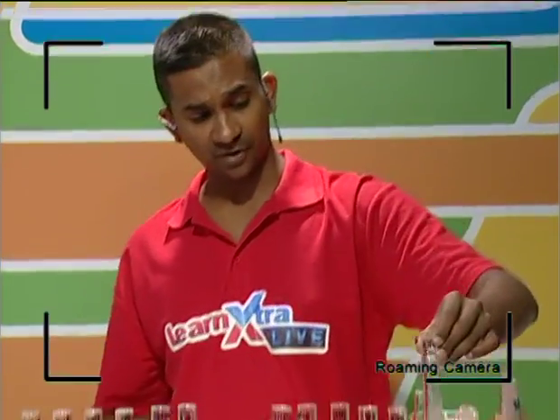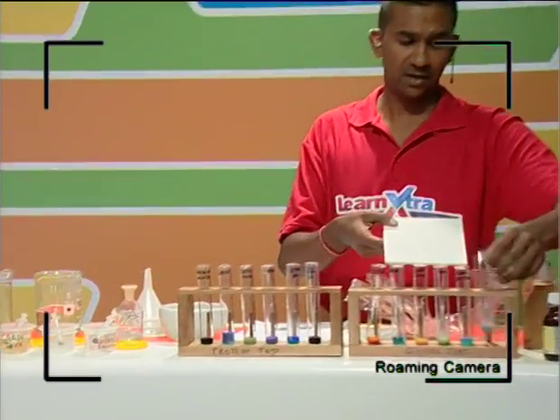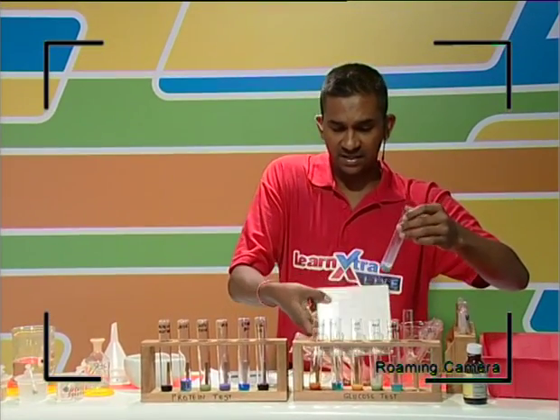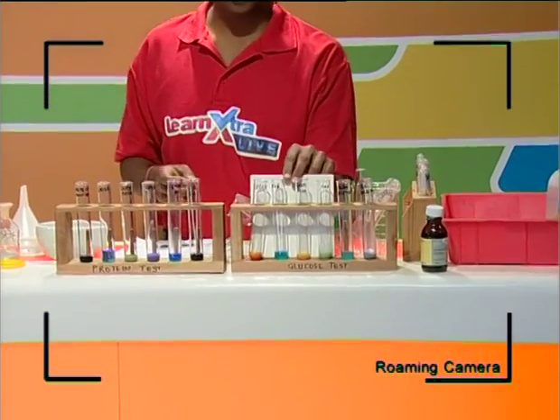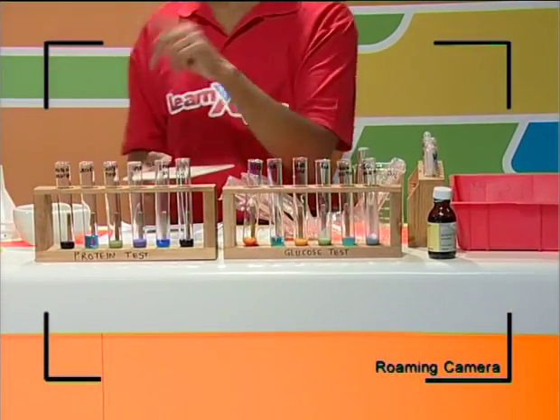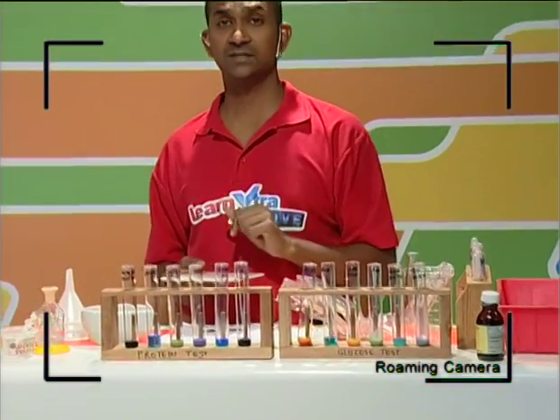And if you're often battling to have a look at the color, you must always use a background that is white. So if I place this tile clearly behind here, you can see these colors are very, very enhanced. Okay, so these are the results. I've tabulated the results for you on the smart board. We're going to get to that in the last session.